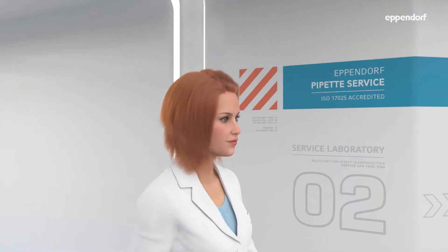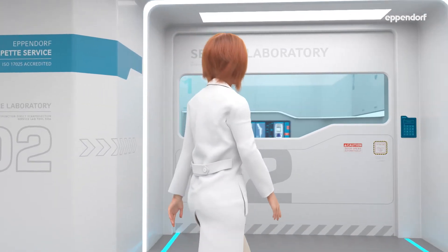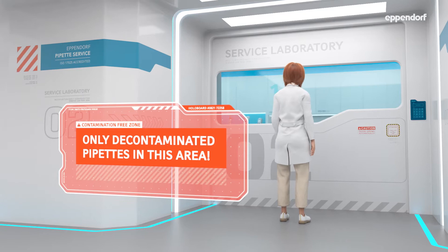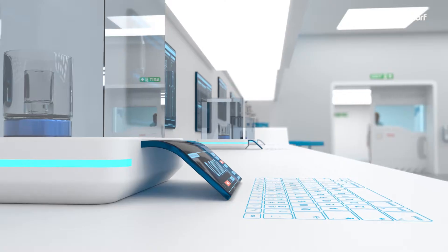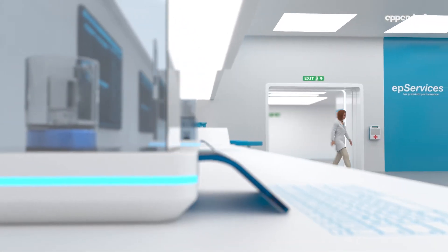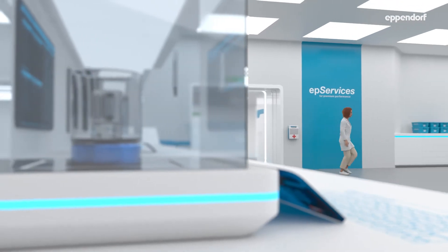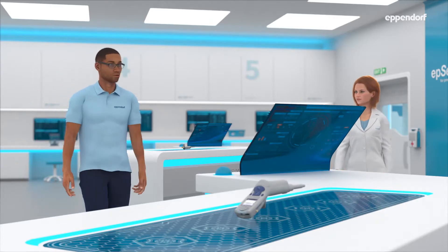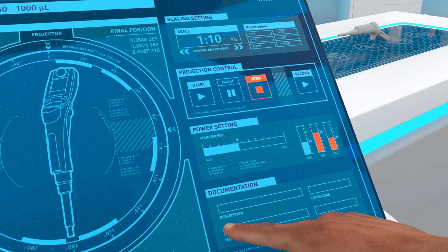Here we are. We will now enter the environmentally controlled zone. Let's take a look at the maintenance of your Explorer Plus pipette from our Electronic Explorer series.